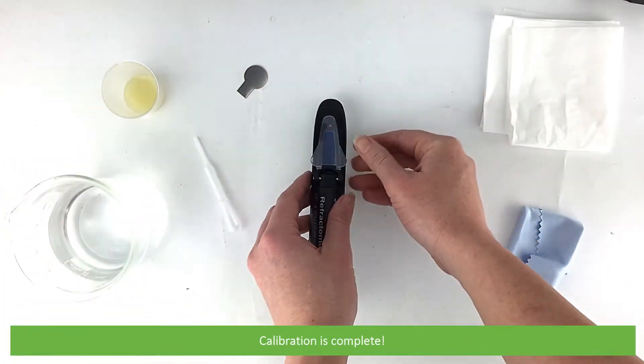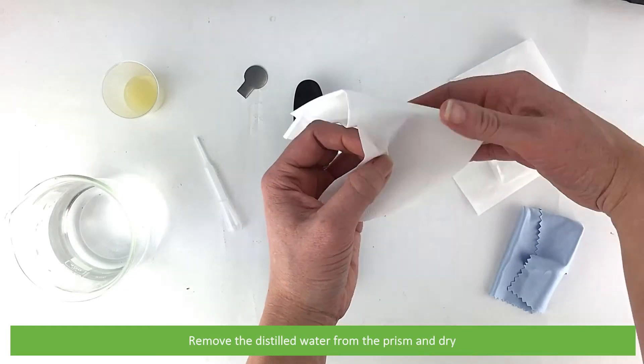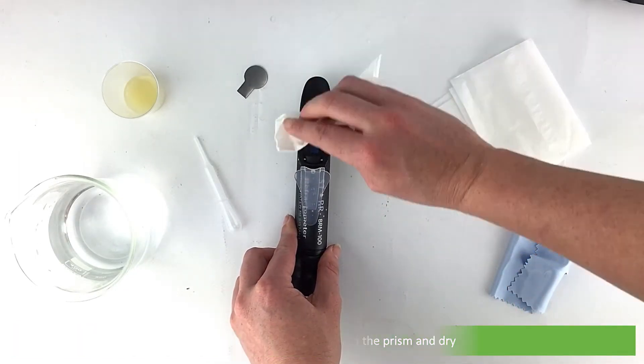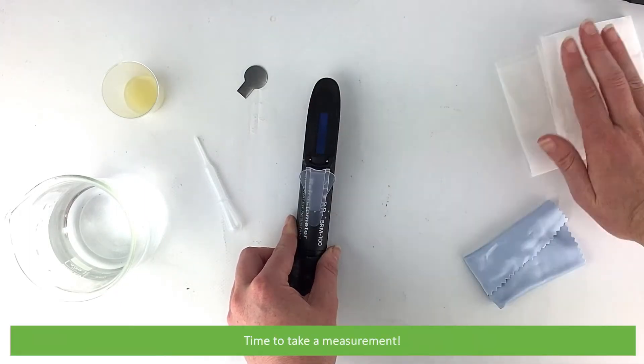Calibration is complete. Remove the distilled water from the prism and dry. Now it's time to take a measurement.